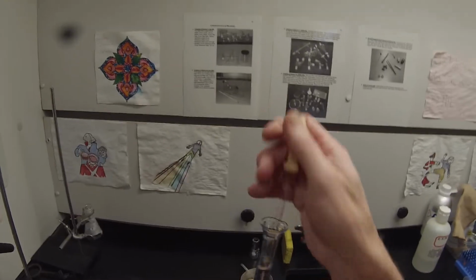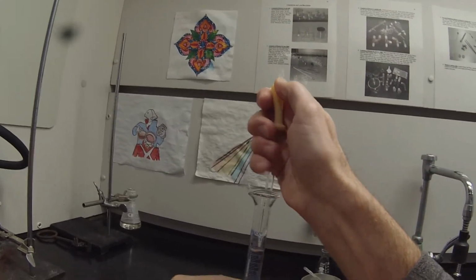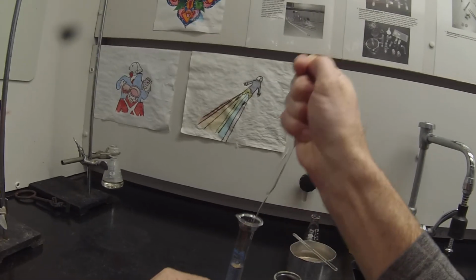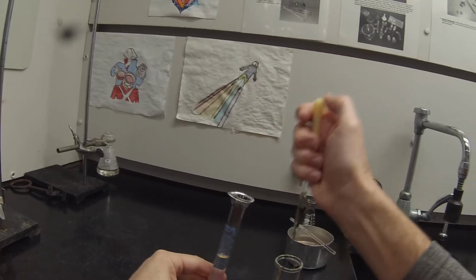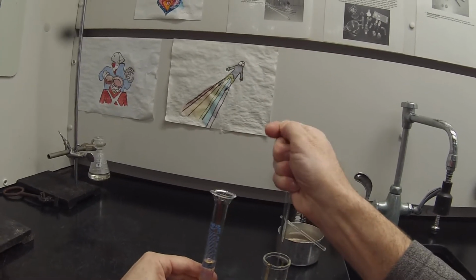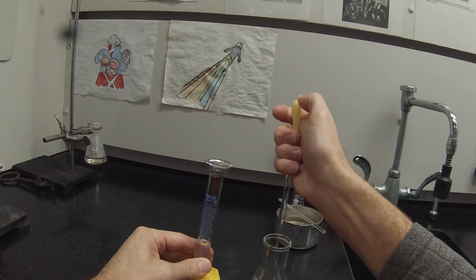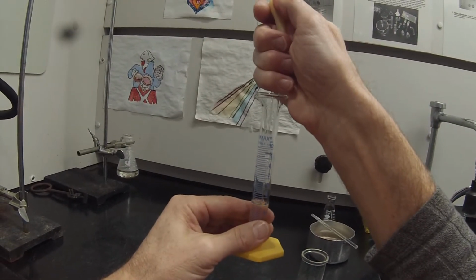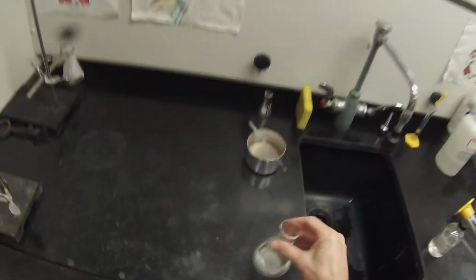And we want 6 milliliters of this 95% ethanol. So I'm going to leave 4 in there. Set that aside for later. And now we're going to measure out 5 milliliters of glacial acetic acid.